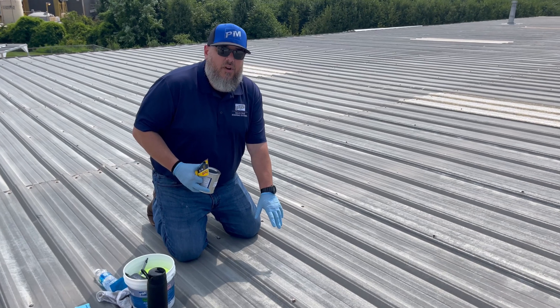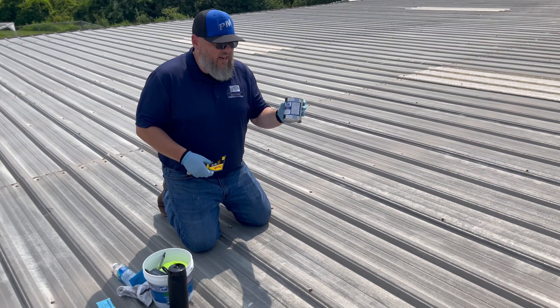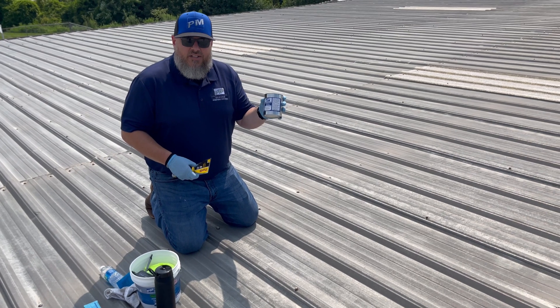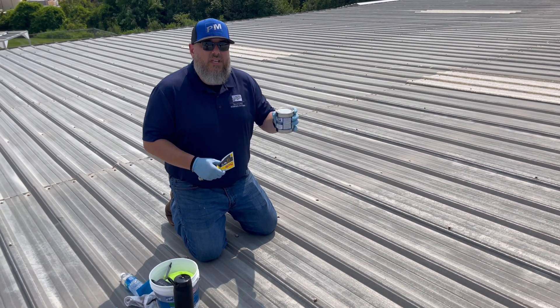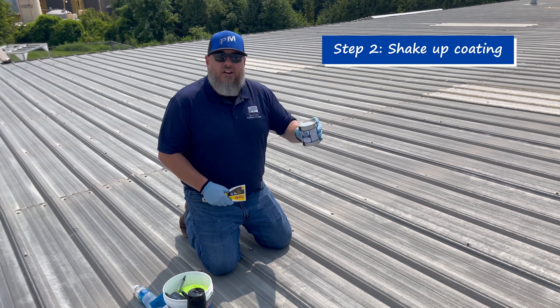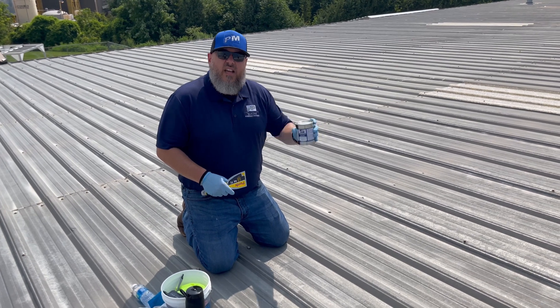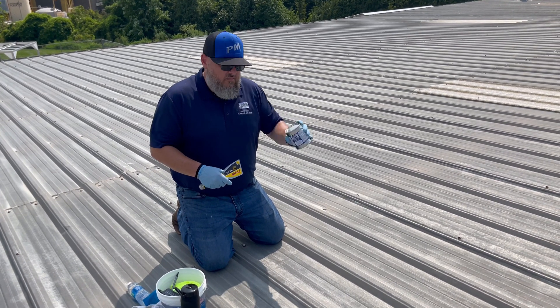Now that we have the section that we're going to do the adhesion test on good and dry, we're going to go ahead and open the tube of HS3200. Make sure before you open this, you give it a really good shake. There is a chance that there could be a little separation in there, so just give it a good shake, 30 to 45 seconds or so, just to make sure everything's good and mixed.